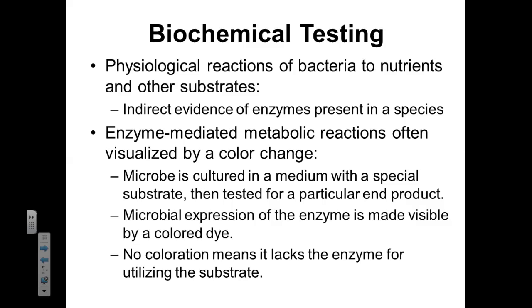That acid can then change the color of a pH indicator, and our media will then go from red to yellow, or it can go from pink to clear. If there's no coloration or no change in color, many times that means that that bacterium lacks the enzyme that's capable of utilizing that substrate. So if we take that bacterium and it is capable of growing on the agar, but it doesn't have the accompanying color change, that means that special ingredient we added can't be used by the bacterium, and that's an important diagnostic technique. Whether or not that bacterium can ferment lactose, for example, is a common diagnostic technique.